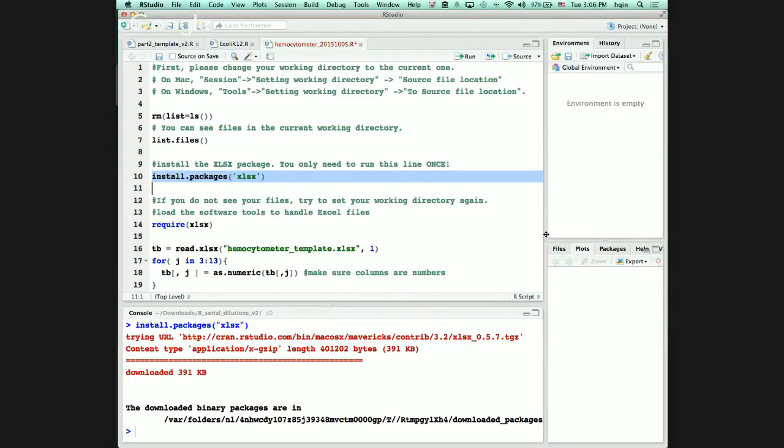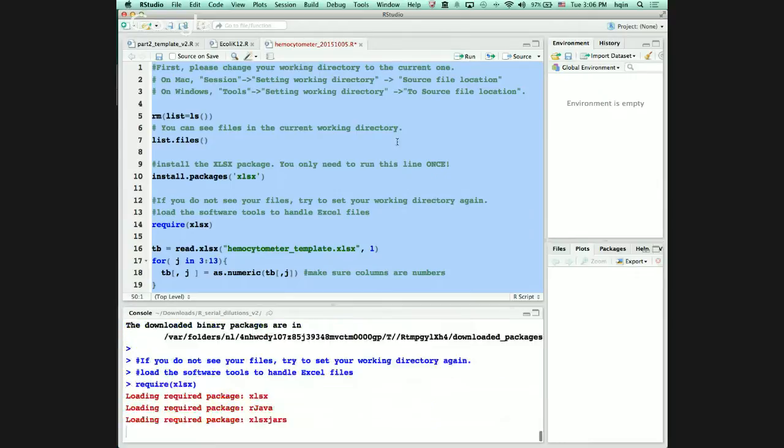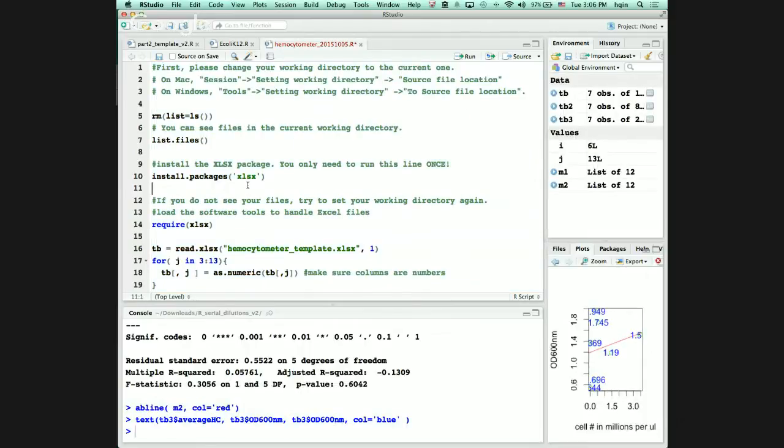Where do you run it after you do that? So we should just click on run? You have to highlight something, then click on run. There's also another button that says run everything, but let's do it step by step. If you really know what to do, you just highlight everything, click run, and everything will be done automatically. But now we want to run it step by step.